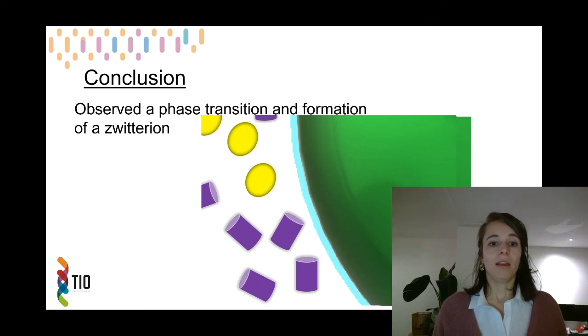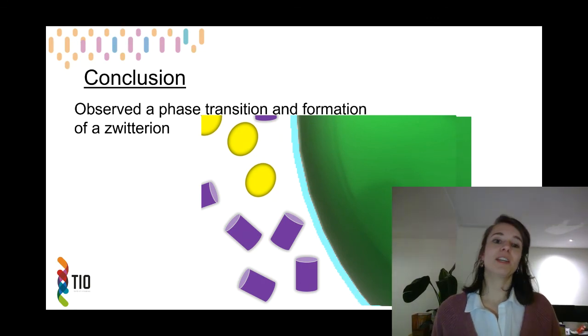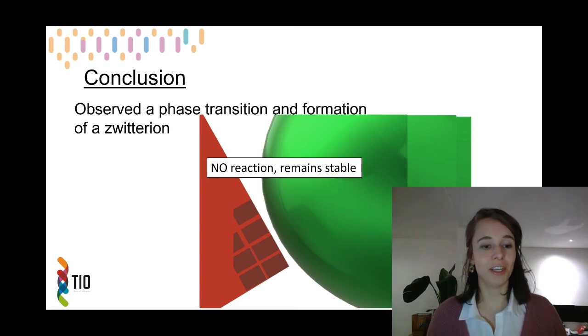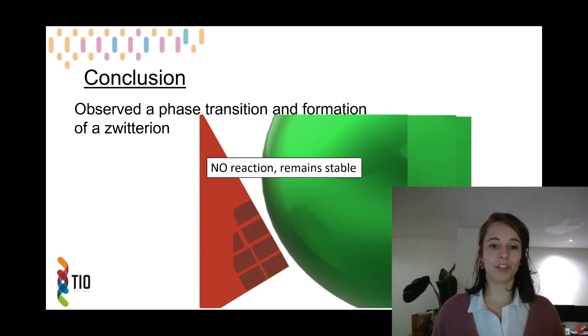So, therefore, moisture can be detrimental when in the wrong hands, and in this case, it was the excipient SSG. And we saw that by removing the moisture, no degradation took place and the interaction was inhibited.